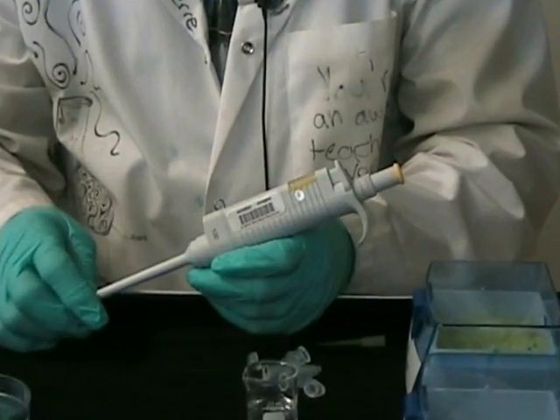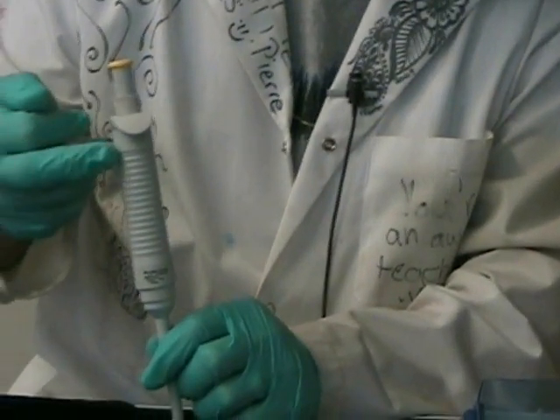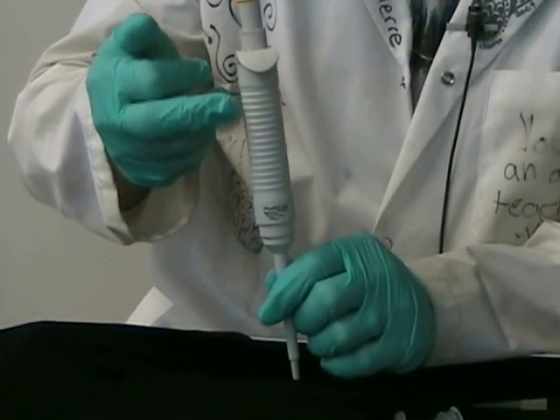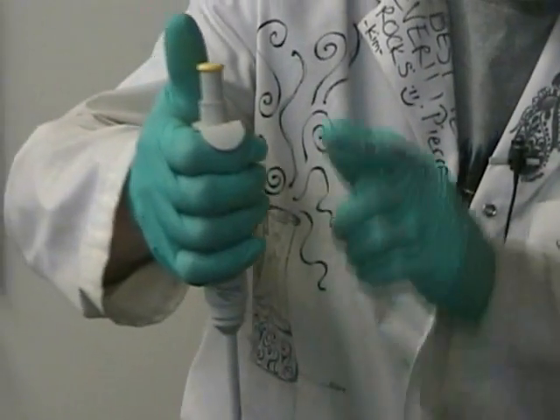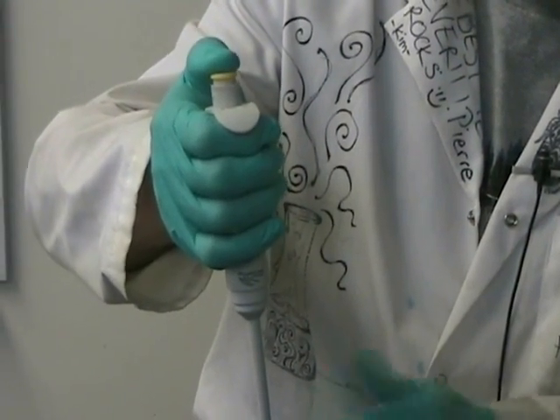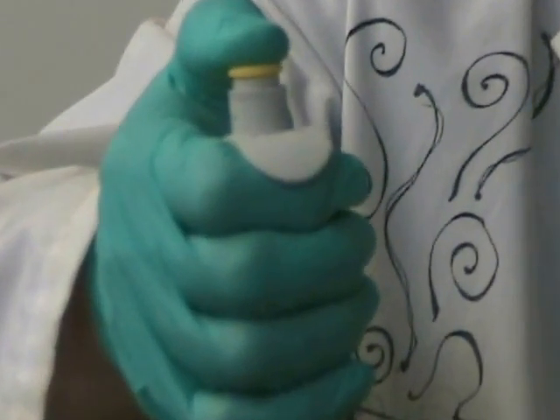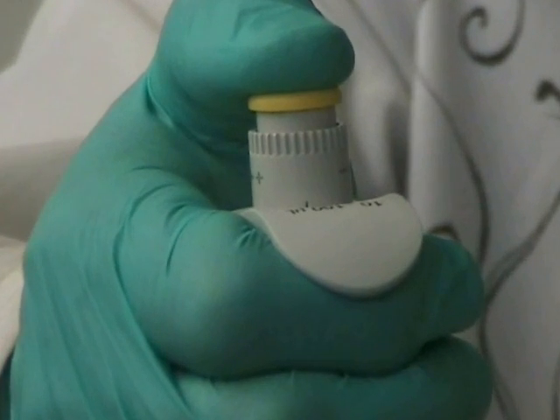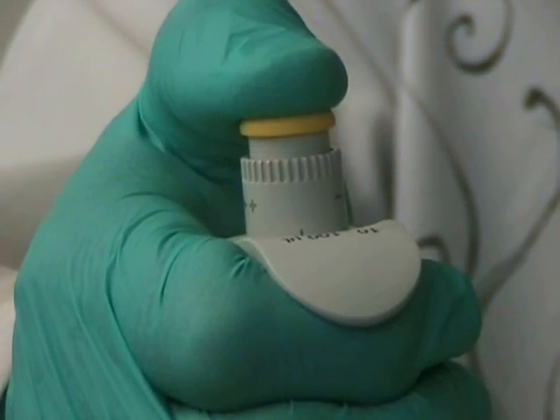Now we're going to look at the mechanism of the pipette. Within the pipette you have two springs in series - one is fairly soft, one is hard. When you want to take a volume, you press from position 0 to the first stage, you compress one spring, and if you press a bit more you'll pick up on the resistance of the second spring and go all the way down.